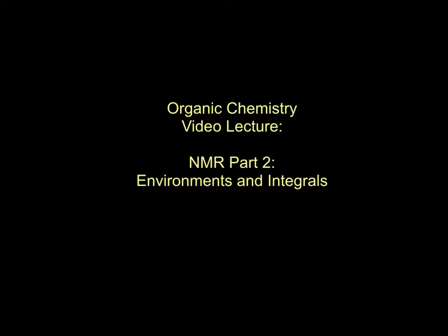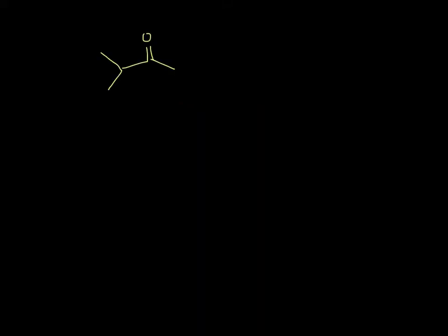Greetings and welcome back. In our continuing evaluation of NMR and what this can tell us about our molecule, we're going to be looking today at the number of environments and also the integrals. So we'll start off with an example molecule, which is this ketone right here.